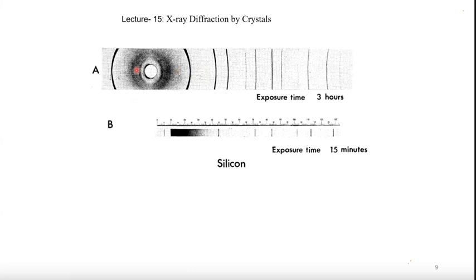Moreover, here we use a capillary tube and more sample, while here it is about 1 milligram or less. You can see how clearly we see the line positions and how well resolved they are compared to the Debye-Scherrer camera.